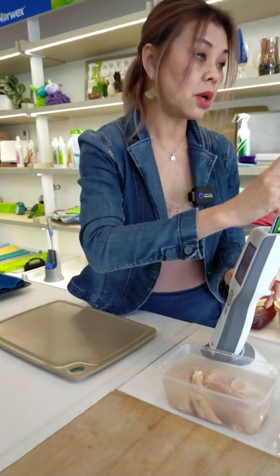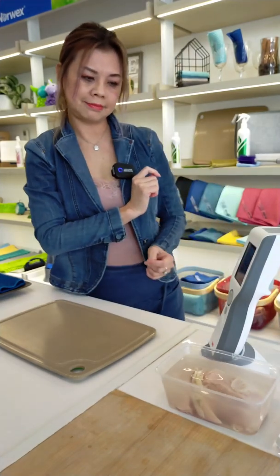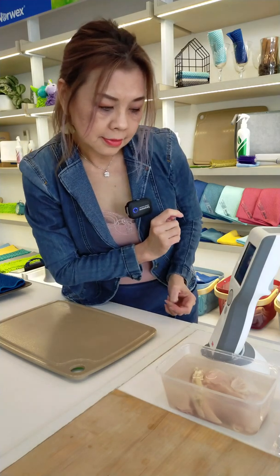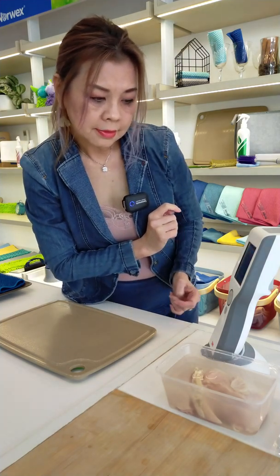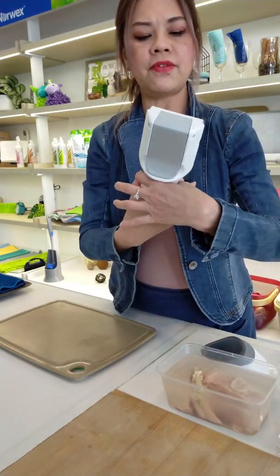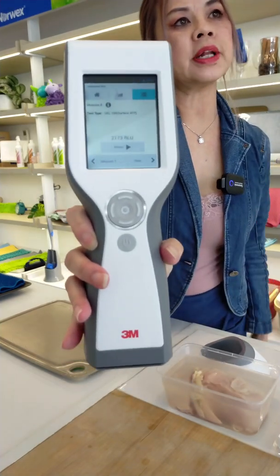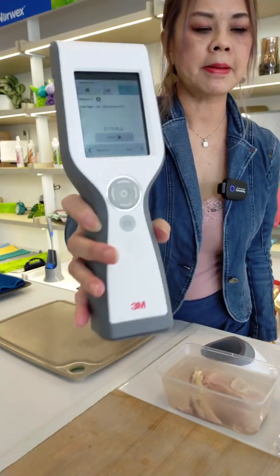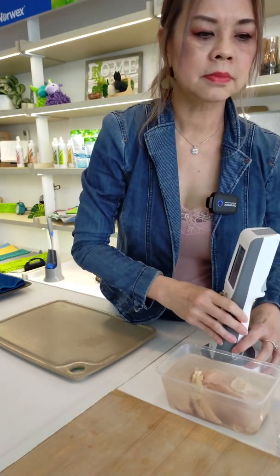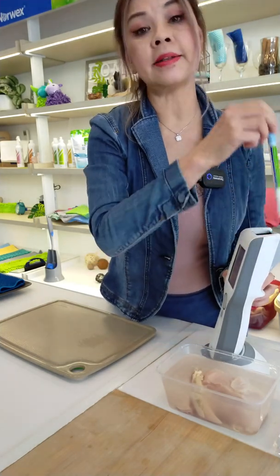The counter cloth did a better job. The kitchen cloth has left 2,173 RLU. I think it will still be more than 99% — it's 99.6%.